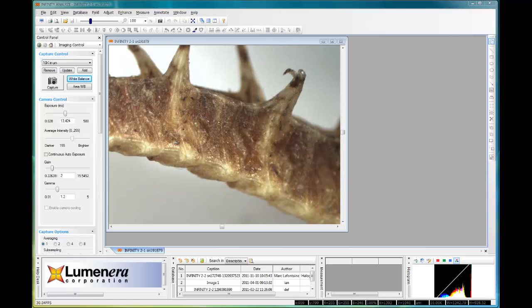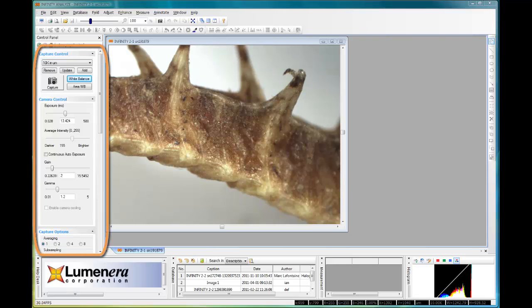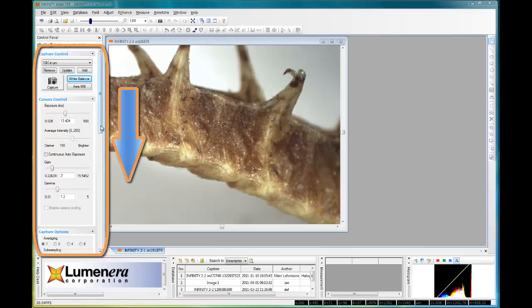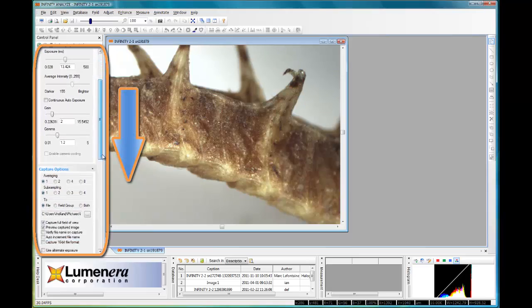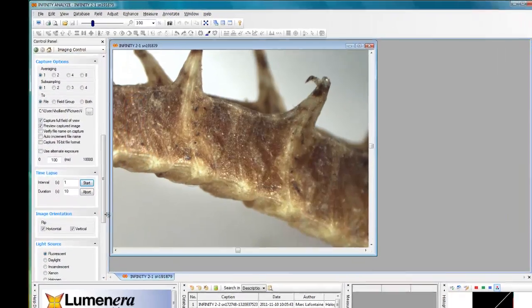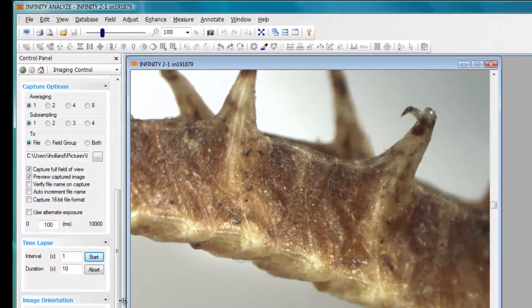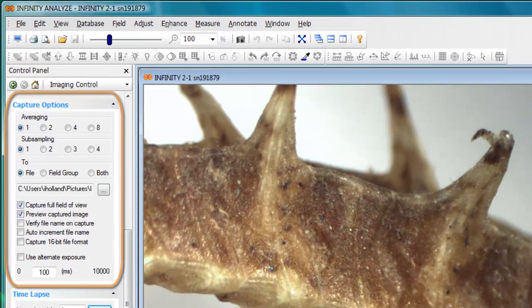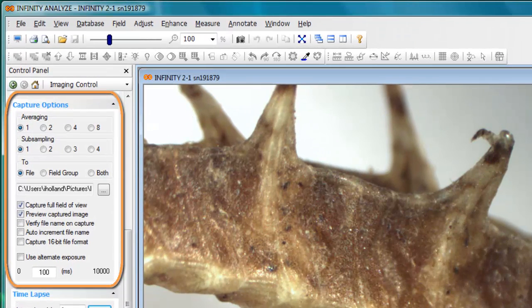Capturing images is a fundamental feature of the Infinity Analyze application. We'll begin by looking at the functions provided on the capture options pane on the left side of the screen.